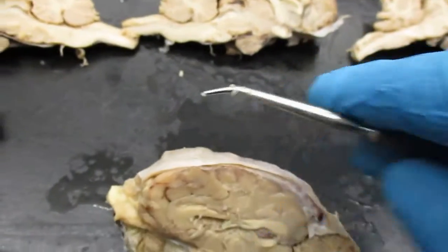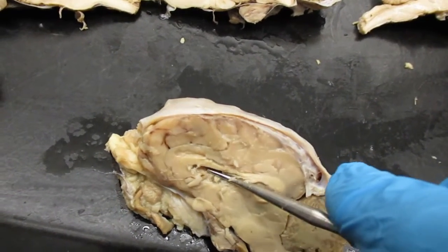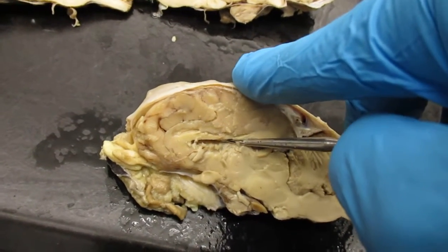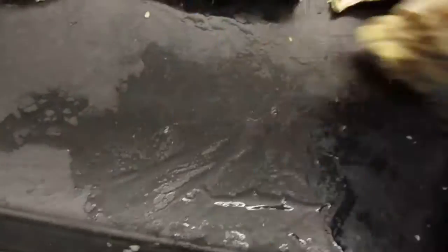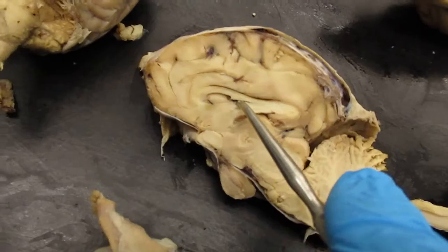So, right here is your lateral ventricle. It just doesn't want to do right. So the lateral ventricle is right there, where the probe is. See that? Deep in here is the lateral ventricle.